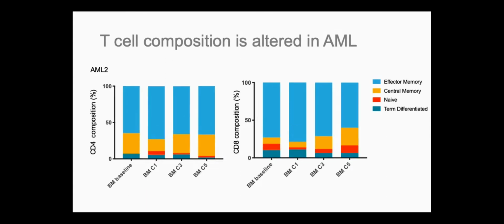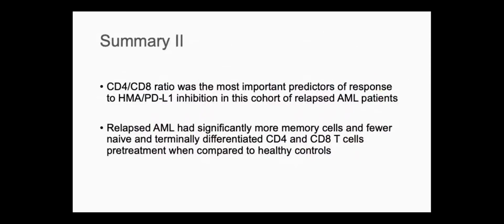that warrants further investigation. In the second sample, we see a similar trend with the reduction of naive and terminally differentiated cells and the expansion of effector memory T cells.